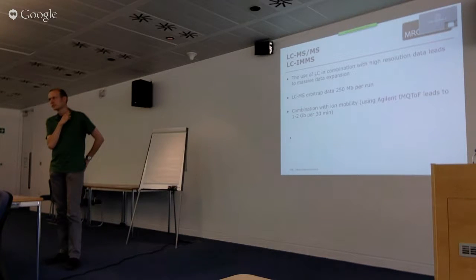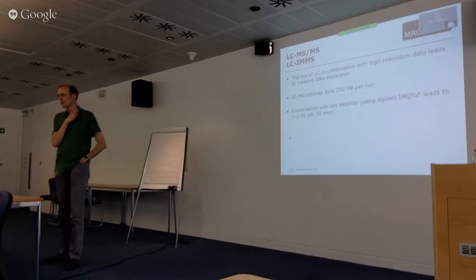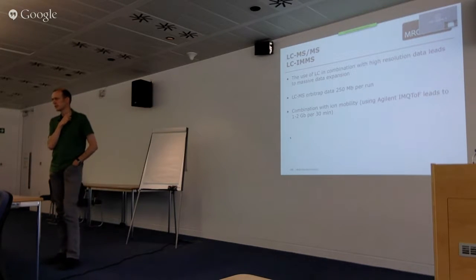I think I had an exchange with James and Jules about this. The system we're using is very simple, but it's the bare minimum to be able to track samples and know where they are. It's very much an ad hoc per project approach.